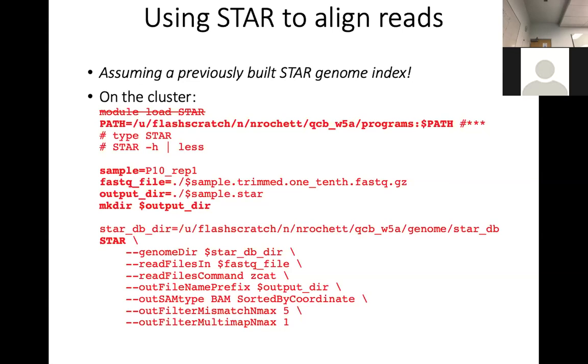Okay. So you can't copy paste because everything is connected. If you look at the lines, every line is one command line except for the ones with slashes.